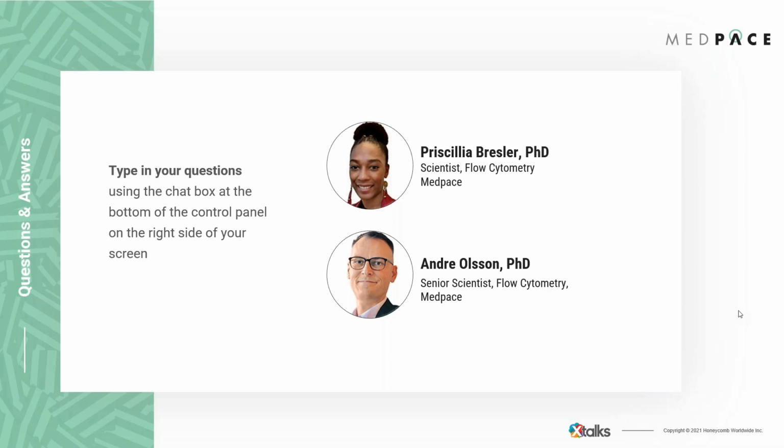Fantastic. Thank you, Andre. And our next question is, can the binding RO data be used as a good marker for efficacy? Can it be used to personalize dose for a patient to have a more efficacious and safe dose for a patient?